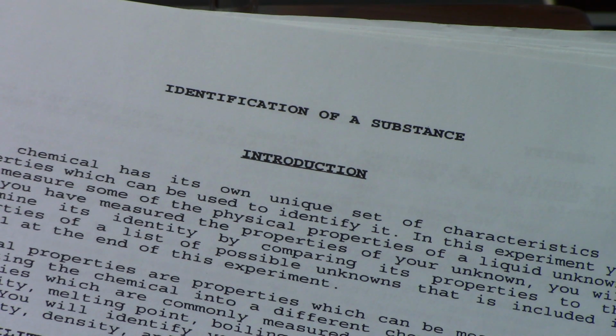Okay, the third test or experiment is to find the boiling point of the unknown. And I'll go over that when I actually do it, but every pure liquid has a unique boiling point. And I'll talk about boiling point when I get there.